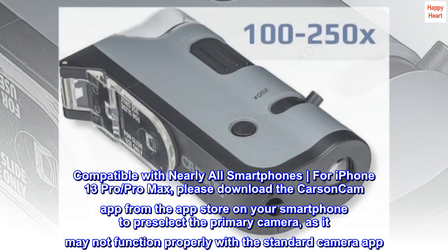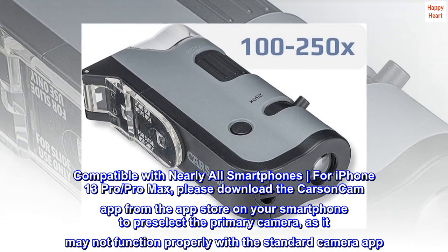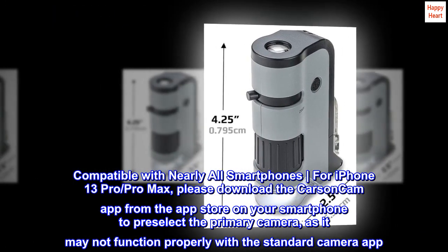Compatible with nearly all smartphones. For iPhone 13 Pro and Pro Max, please download the Carson Cam app from the App Store on your smartphone to pre-select the primary camera, as it may not function properly with the standard camera app.